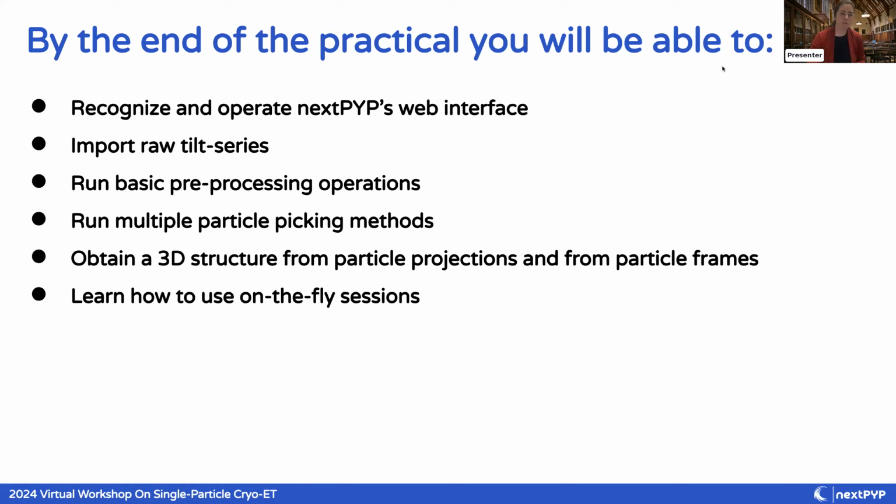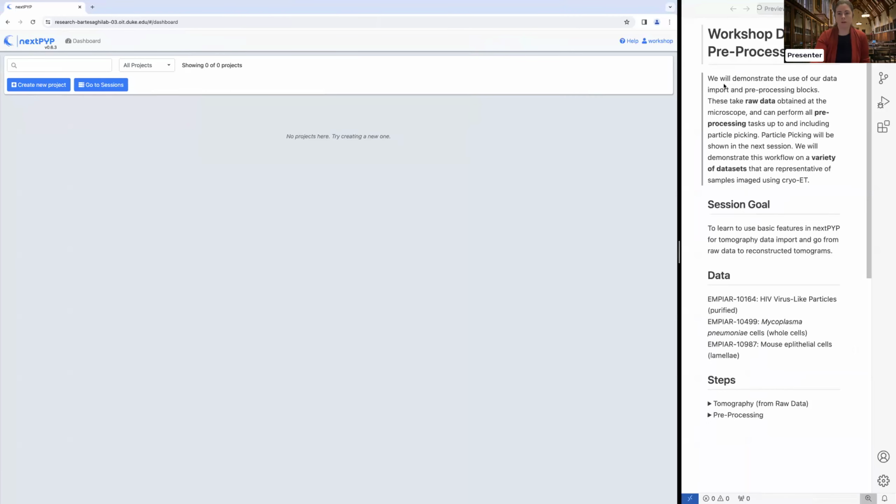All right, now we're going to transition over to doing the pre-processing part of the practical. The part that I'm going to cover now is going to be the import tilt series and data pre-processing part of this. All right, so here's the pre-processing.